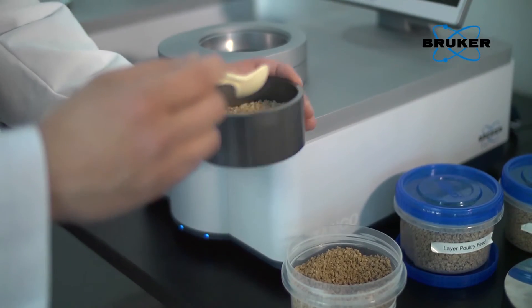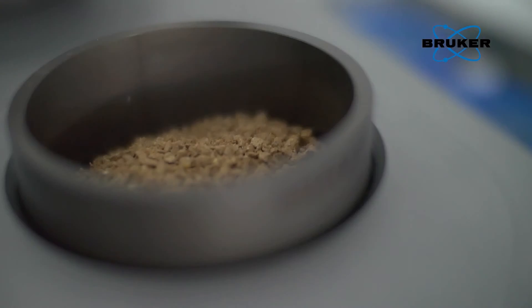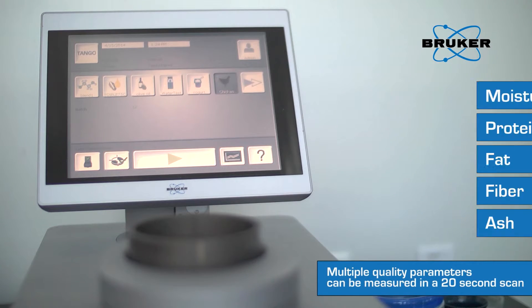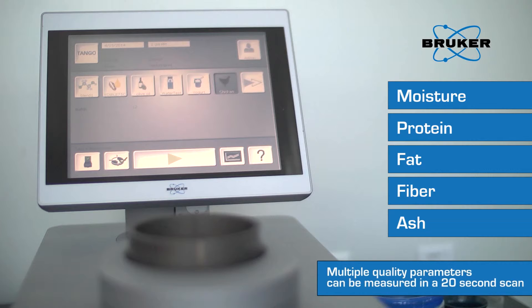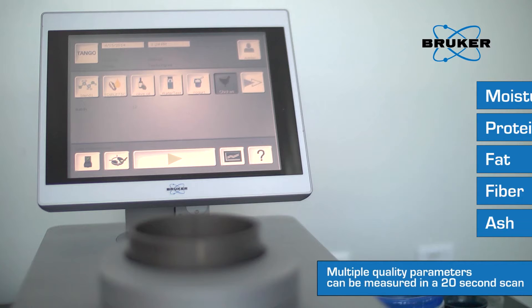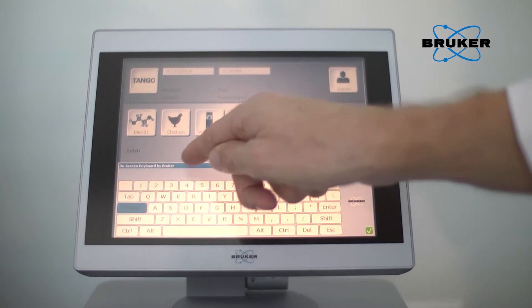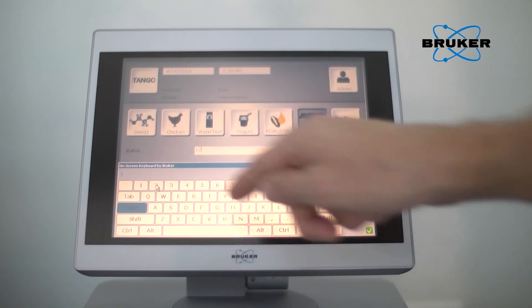The Tango offers efficient and cost-effective analysis for material identification and quantification in a wide variety of application fields. The comprehensive application support of the Bruker specialists helps to select the optimal measuring method as well as appropriate accessories and software solutions — from your raw ingredients, through intermediate steps of mixing, blending, grinding, conditioning, and pelletizing, to the finished product.